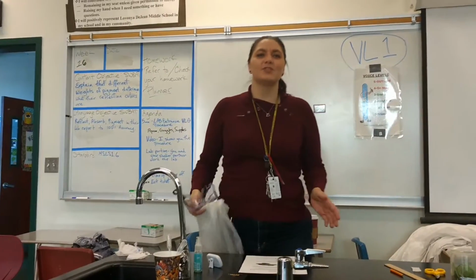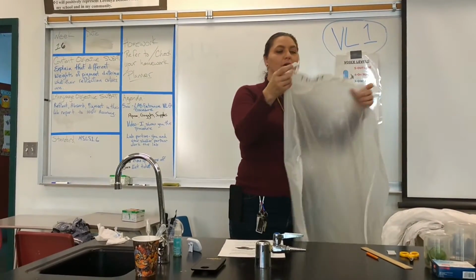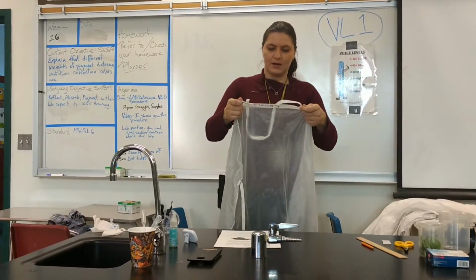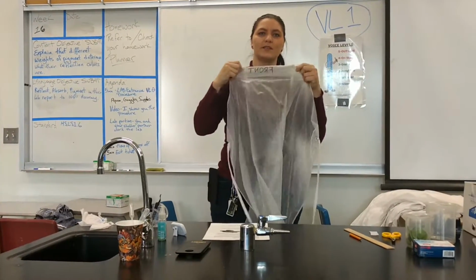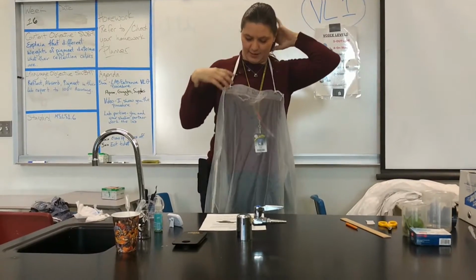Hi guys, it's time to do our chromatography lab, so we're going to be entering the lab. The first thing I'm going to do, of course, is grab the correct apron. Matthew, which way does it say? Does it say front? Can you read front? Okay, then this is the way I need to put it on.